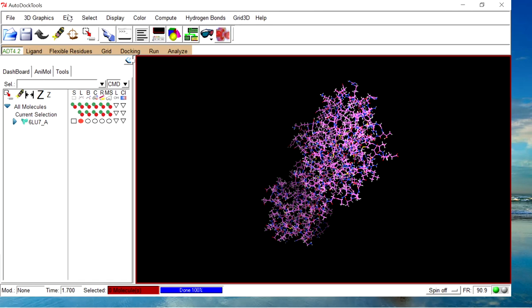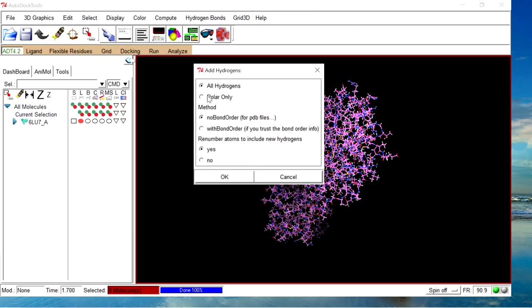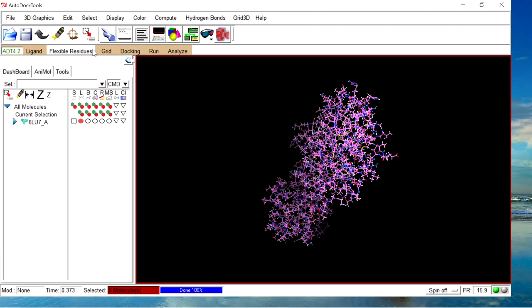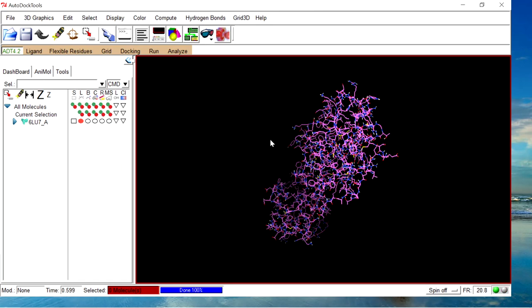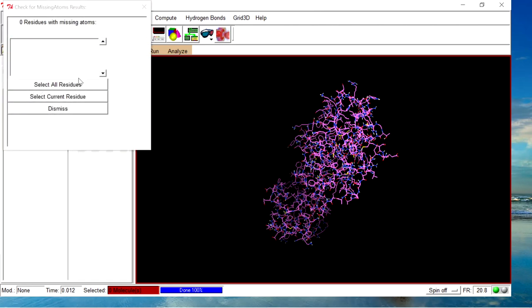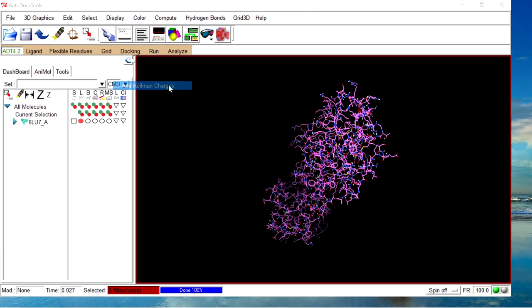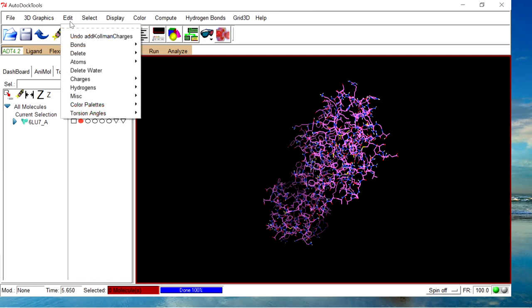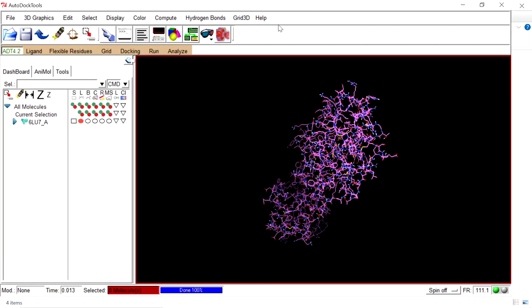The file is imported. We are not going to delete water because it was already removed in the previous step. Next, add hydrogens — Add, Polar Only. After adding hydrogens, merge the non-polar hydrogens. Check for missing atoms — zero residues with missing atoms, so no issues. Add Gasteiger charges for the protein. Then go to Edit, Atoms, and assign the AD4 atom type. Protein preparation is now completed.